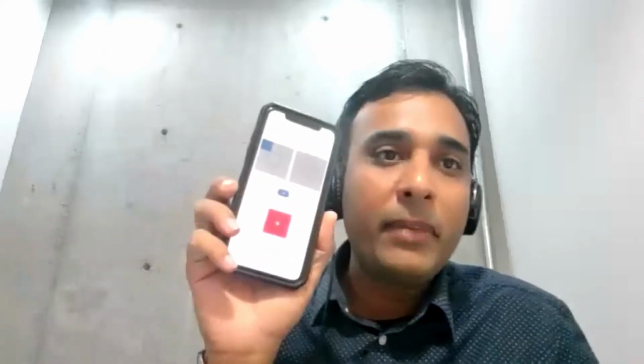Okay. So just imagine that you are with your microscope. So you have like this option. You have basically your hemocytometer here. Many people do so many repetitions to make a very precise number, but we will go with only one. So for example, just click on minus. There is an option here. This is the minus number. You see it here, blue. Click on it. So you will have only one grade. One square. Click on it, please.